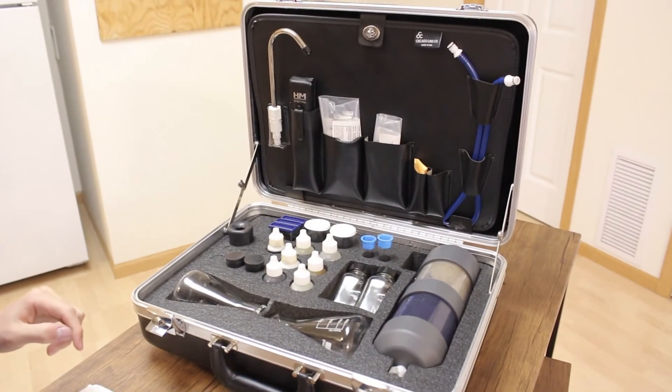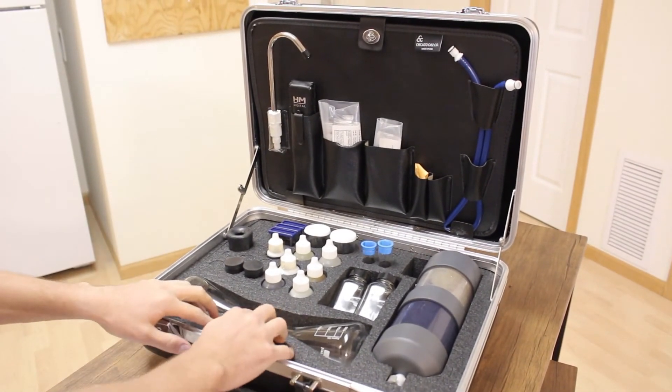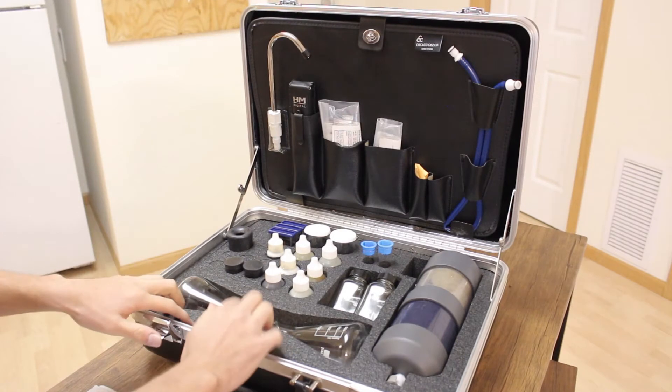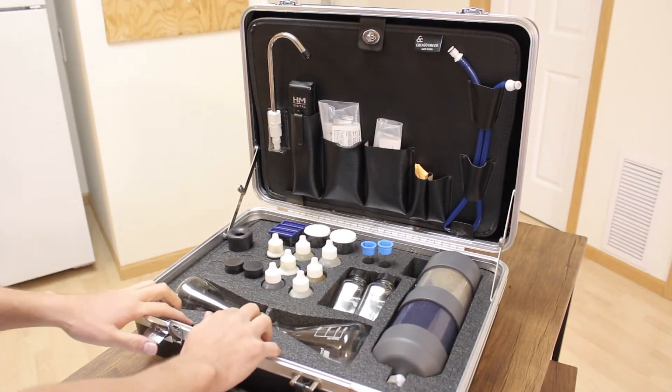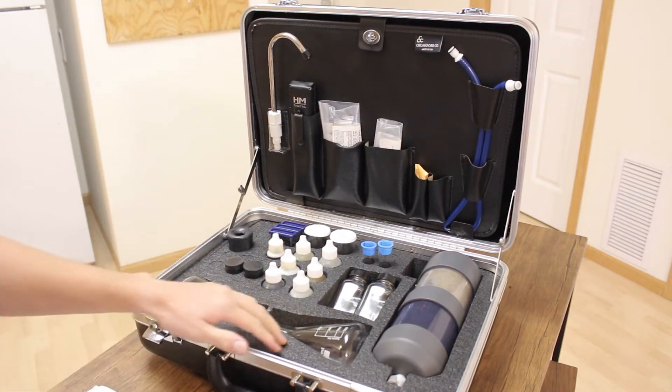I really like the way it's organized inside this kit. The foam layer down here is actually a really hard foam, which is nice. I've found that it holds everything together nicer and it's easier to clean.